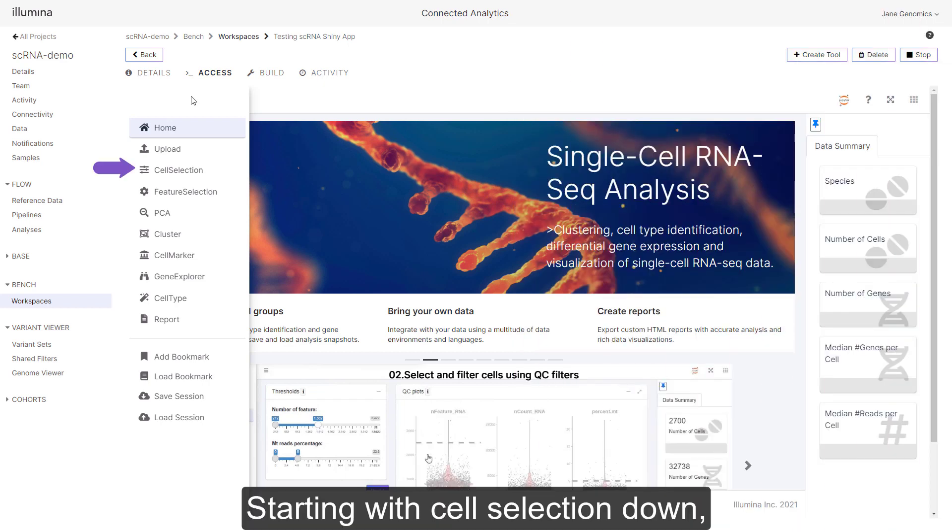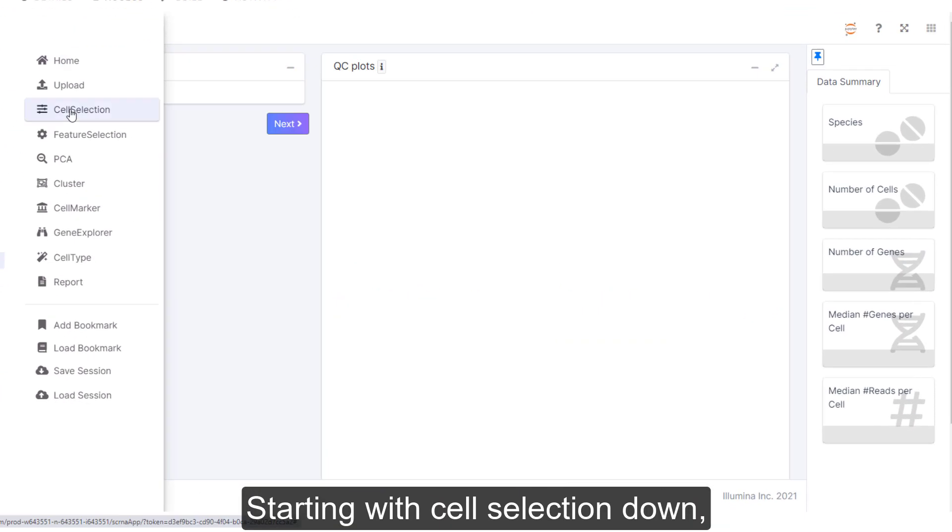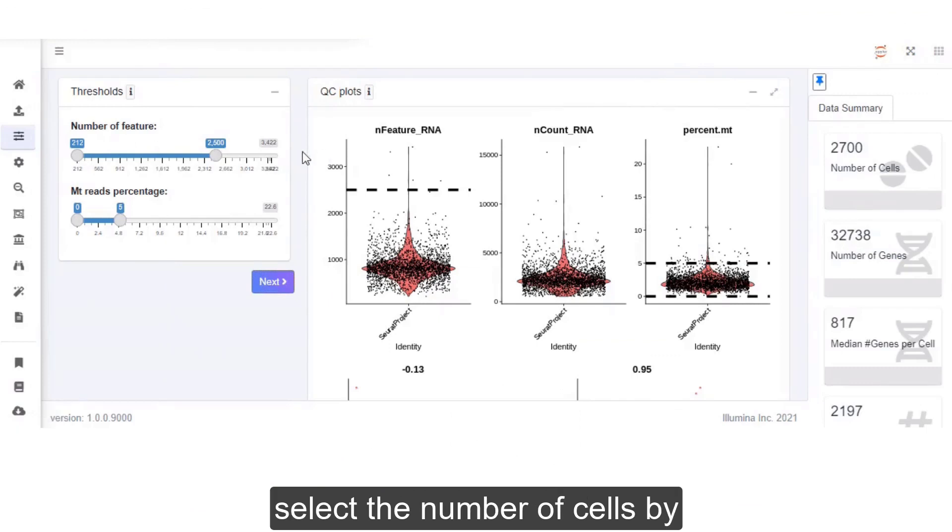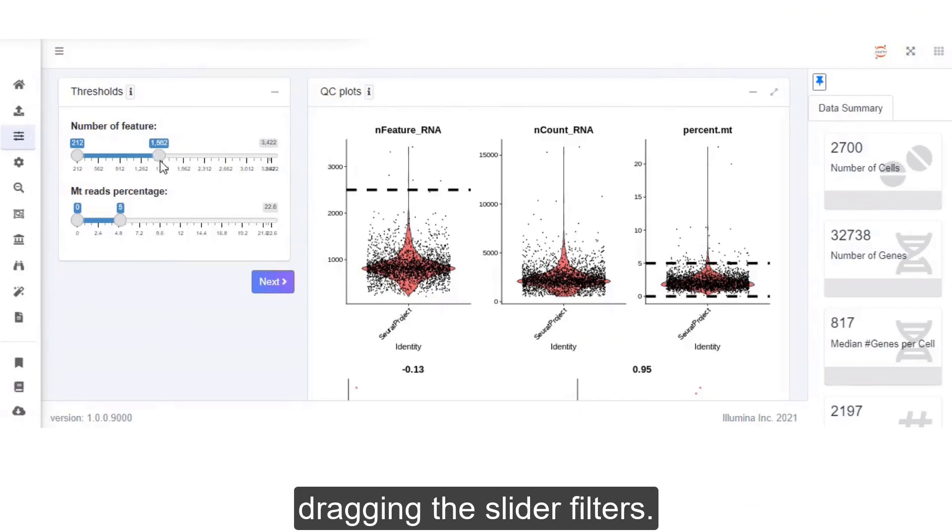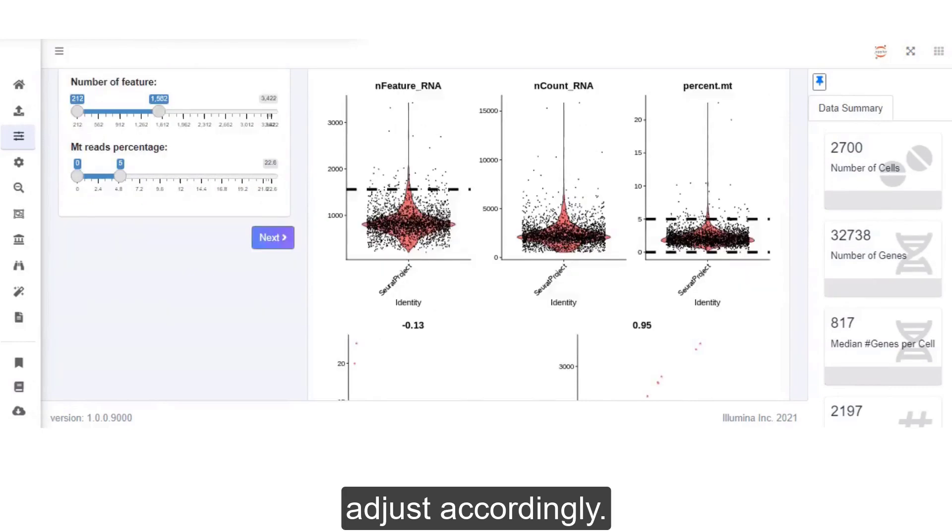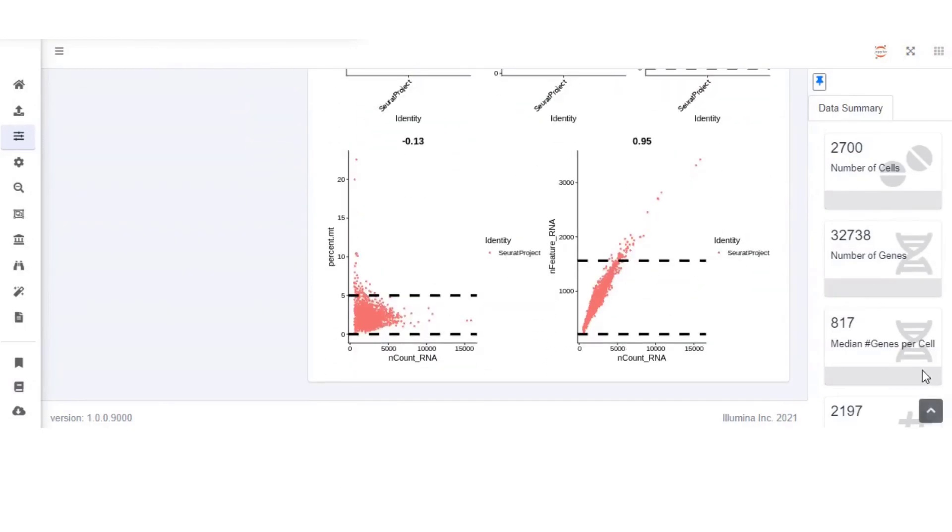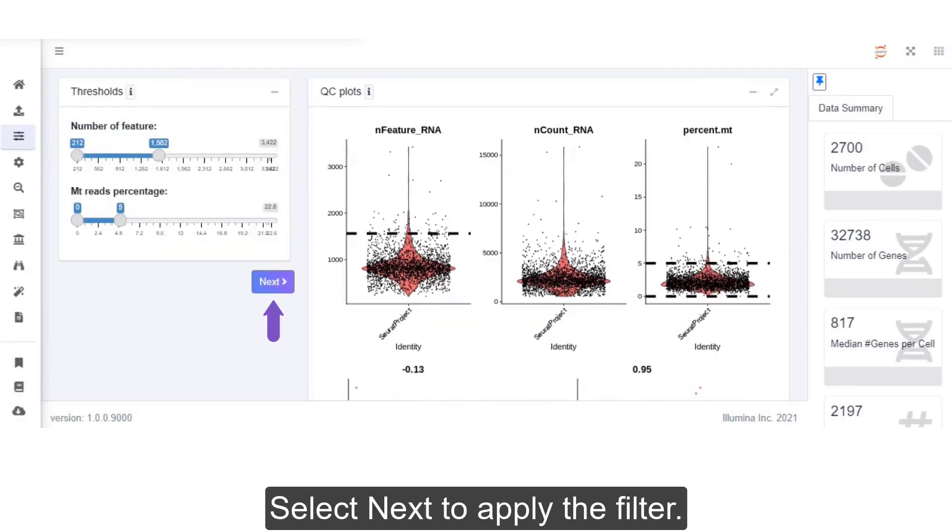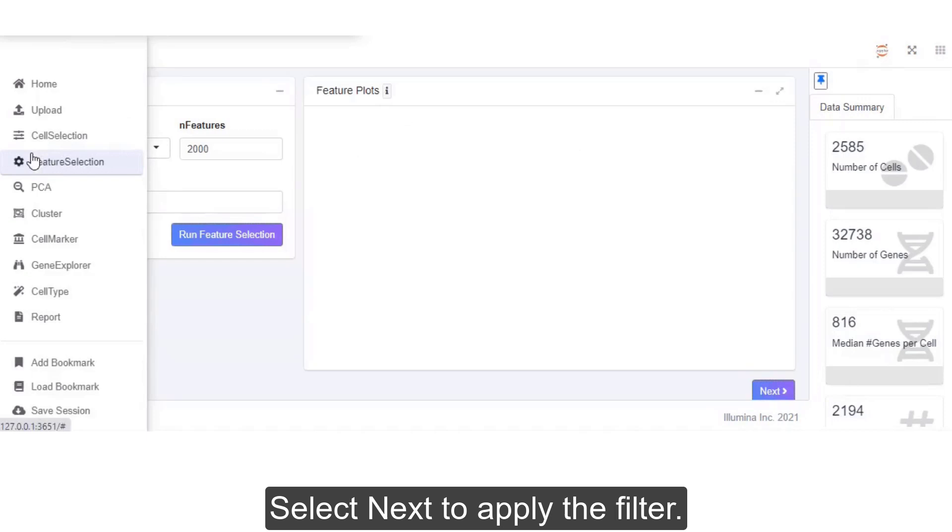Starting with cell selection, down-select the number of cells by dragging the slider filters. Note that the QC plots on the right adjust accordingly. Select Next to apply the filter.